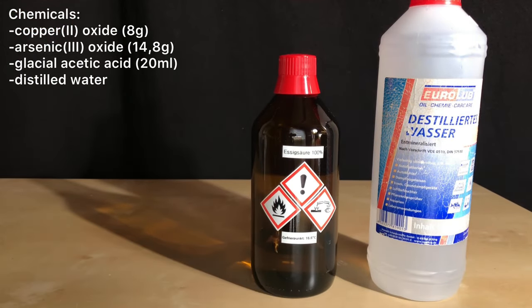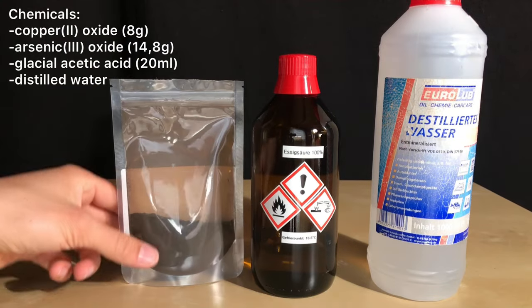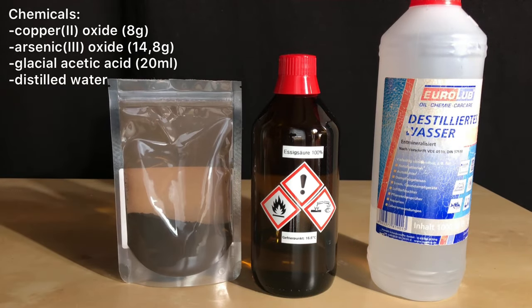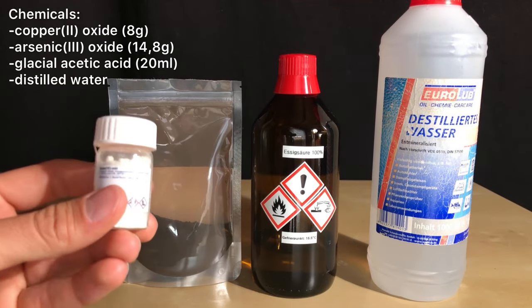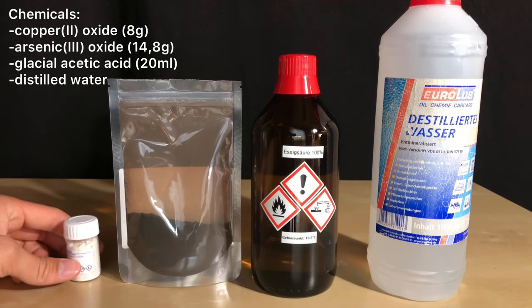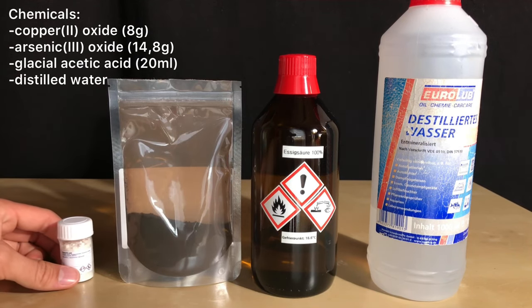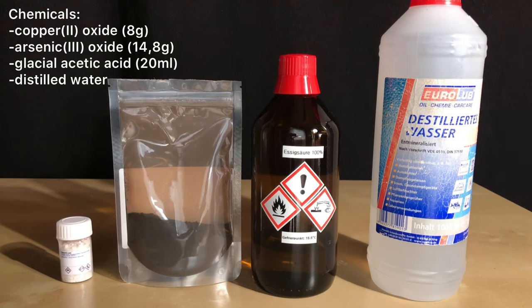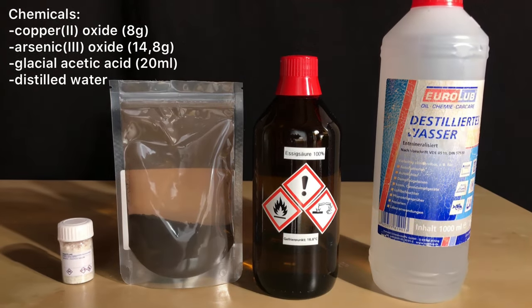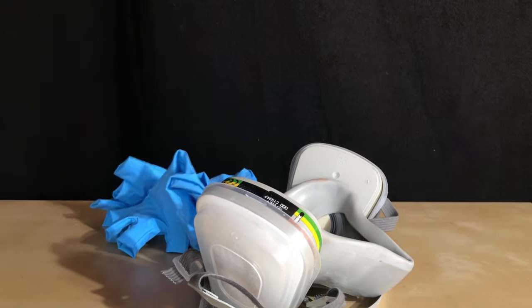For this preparation, distilled water, 14.8 grams of arsenic 3 oxide, 8 grams of copper 2 oxide, and 20 milliliters of glacial acetic acid were used. The amount of glacial acetic acid used was a huge overkill. Instead of copper 2 oxide and glacial acetic acid, or acetic acid in general, copper 2 acetate could be used directly.